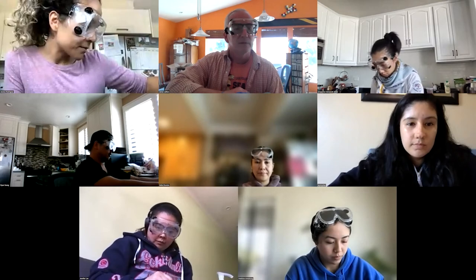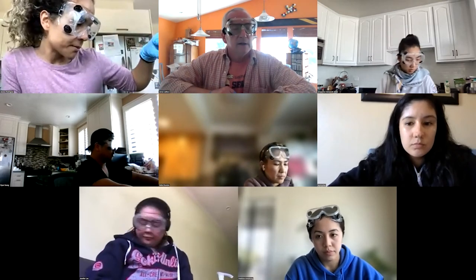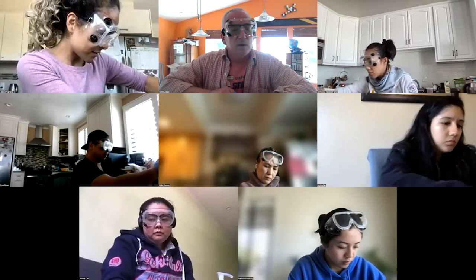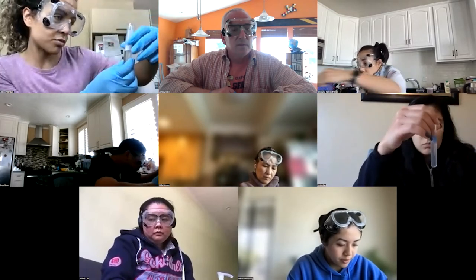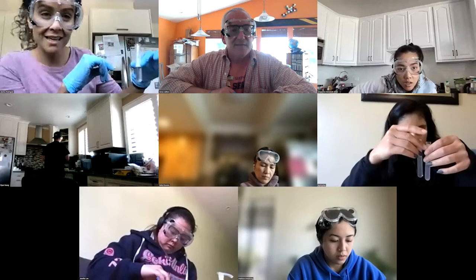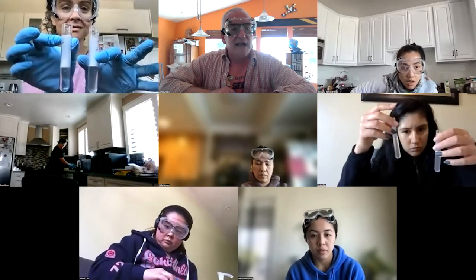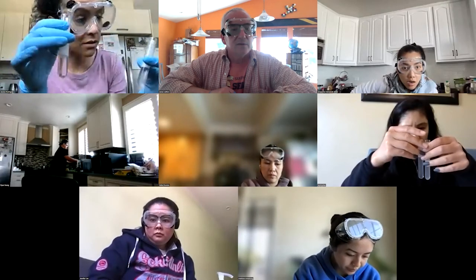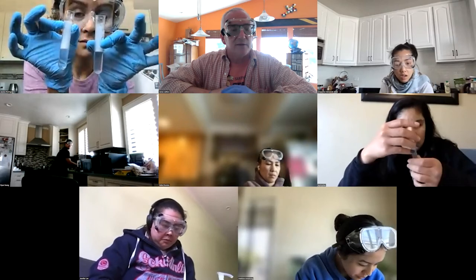Professor? Oh, question? Yes, Jessica. What is supposed to be the difference between the hard water and the purified water with the soap? Because I got the foam, it's exactly the same. Because one has had oil added to it, right? Yes, this one already has the oil added to it. So you really can't compare them till you add the oil to the other one as well.